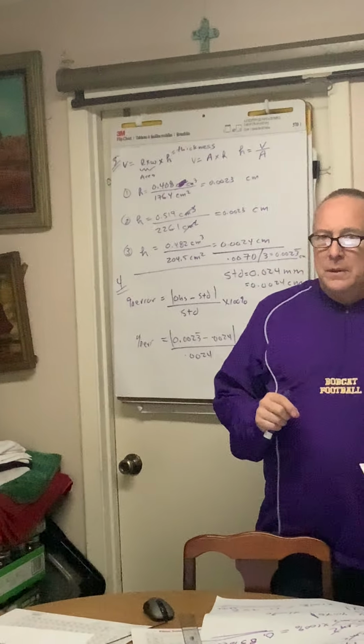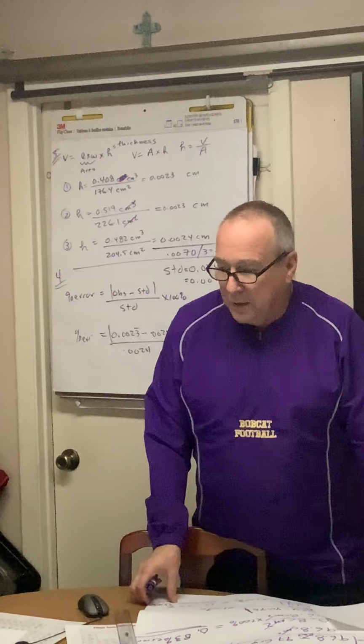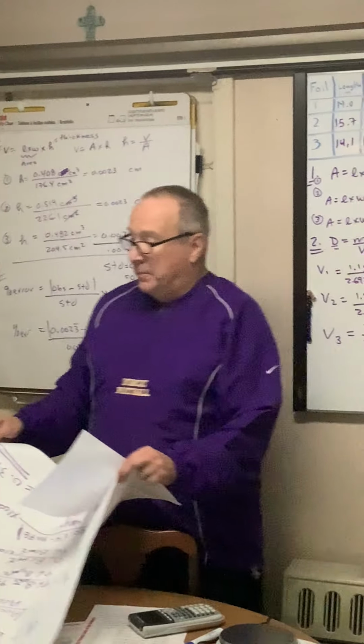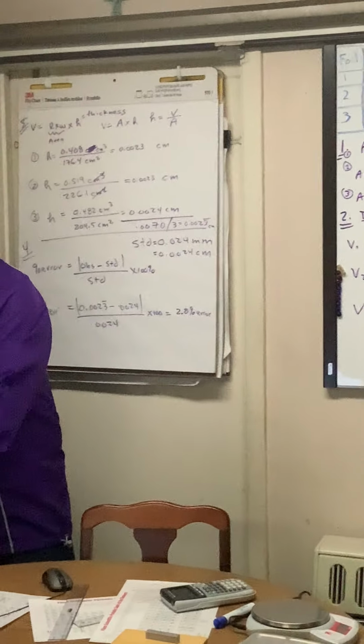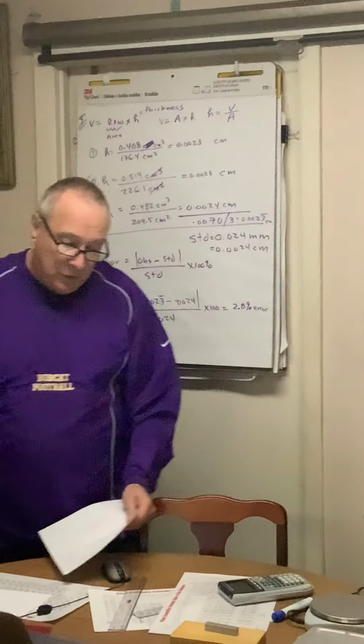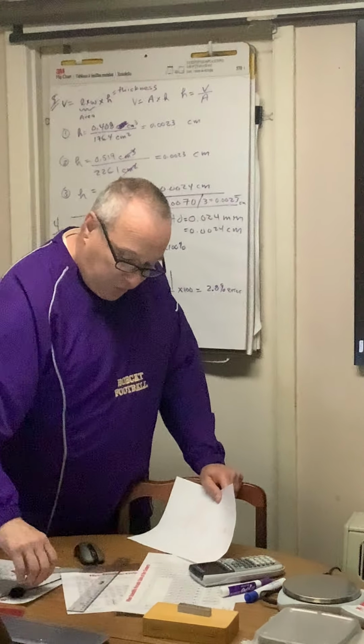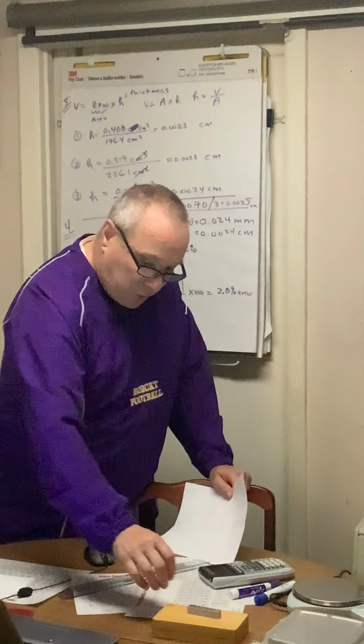That's pretty good for using a simple, common classroom ruler and an accurate but not a particularly precise balance. Those balances are very accurate, but they only can weigh out to 1/10 of a gram. We could do this and get better results by doing more samples or using a more accurate ruler.